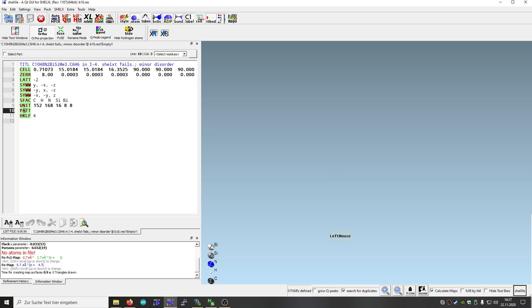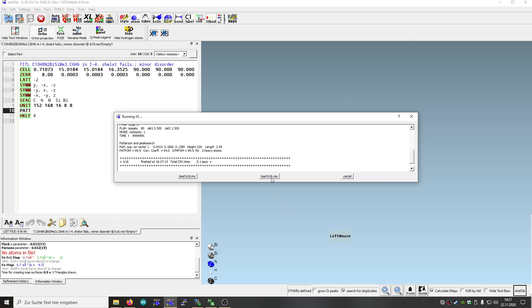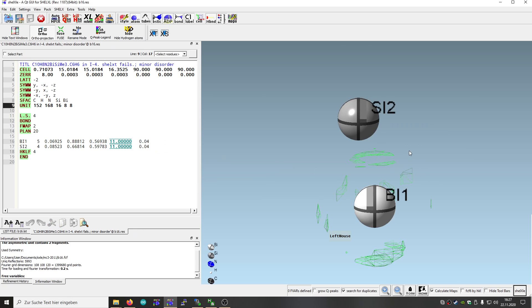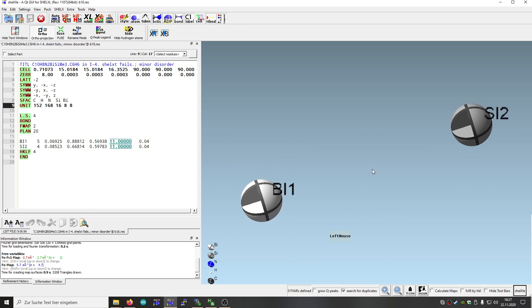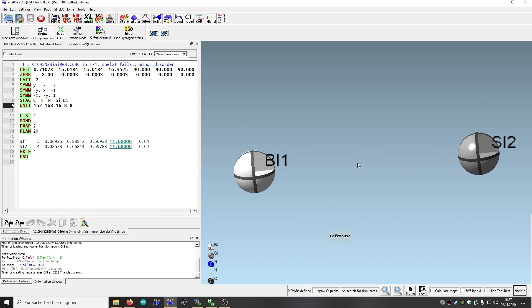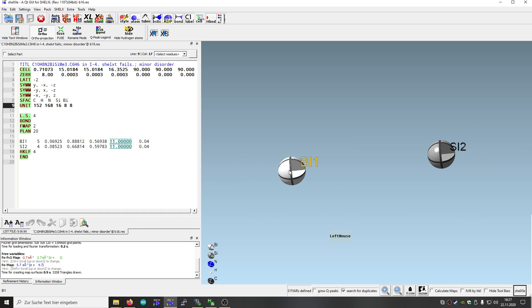We just add this path after the UNIT instruction and before the HKLF instruction, and we click on ShellXS — and here we are, there's the solution. The solution in this case is just two atoms: one is bismuth and another one is silicon.